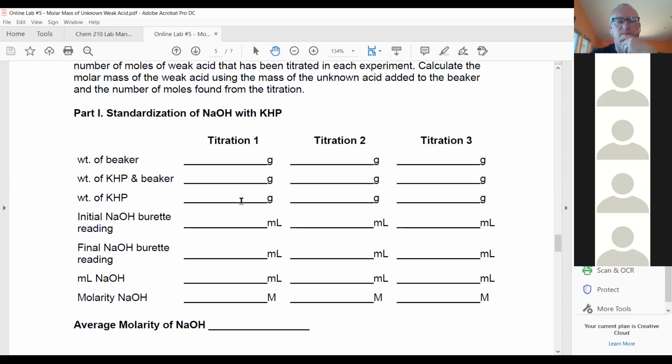Okay, when you say the first titration and the second titration, so I will start to change the amount of everything from the beginning, or just when? You can change the amount of KHP, or you can keep it the same. Yeah, but each time, try and do something a little different. Like try adding smaller amounts of the sodium hydroxide to see if you can get it even closer. Or maybe you could try just hitting the pour button and see if you can get it that way.